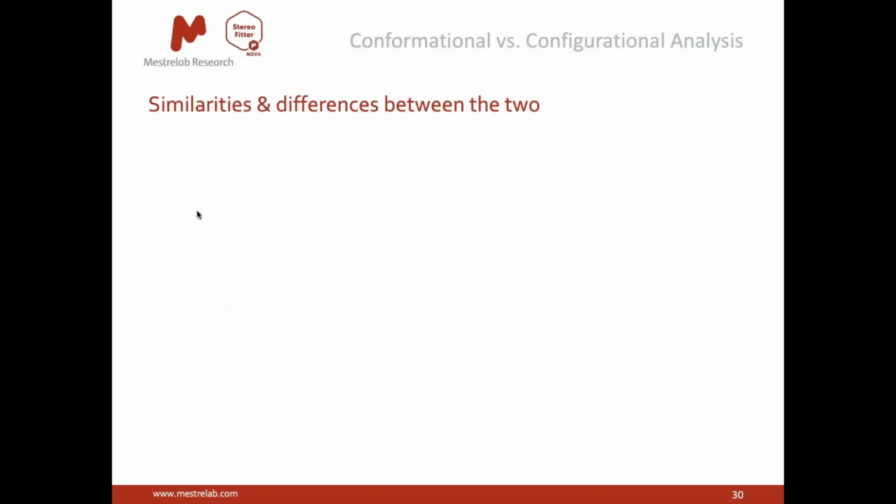At the risk of repeating myself, and before I move on to the demo section of today's presentation, I just wanted to go over the similarities and differences between the conformational analysis and configurational analysis available in Mnova StereoFitter. So let's start with conformational analysis.